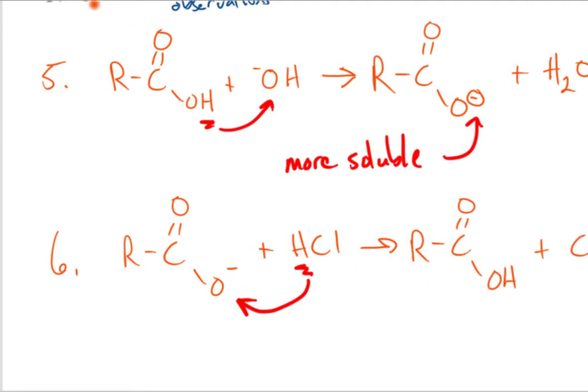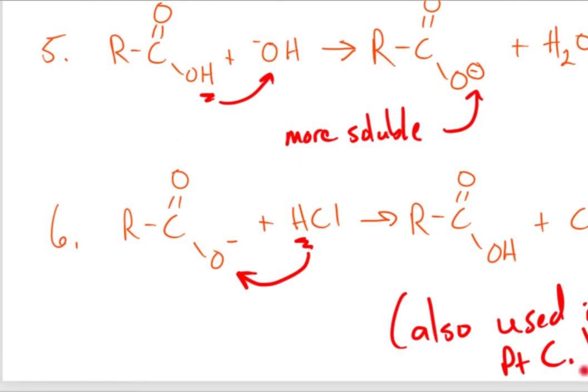This particular reaction, it's also used in part C of this lab. And when I talk about part C, I'll reference this again. But let's go ahead, take a look at this reaction. Just like all the others, I've cut and pasted, sped up where needed, so it keeps things moving with these experiments.